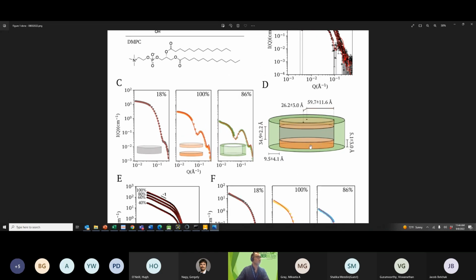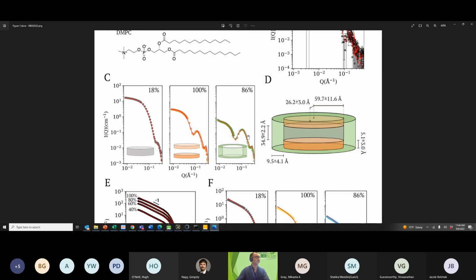So here is more like a core shell structure that we have, which is maybe similar to a nanoparticle. And for those kinds of samples, we apply a shape-dependent model. So we have structure factors for those structures that we can use to fit your data. This is the best approach for the kind of fitting that we want to do.